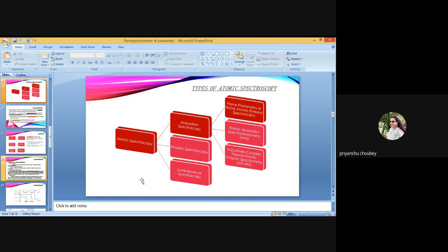By definition, plasma refers to a hot gas in which significant fractions of the atoms or molecules are ions. Plasmas are electrically conducting and have been referred to as electrical flames, as no combustion takes place. Instruments using a plasma source generally use inert argon gas.